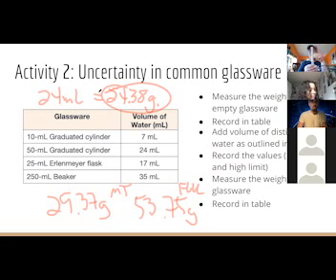So basically, when we're trying to measure 7 in our 10 mil, there's measurements above and there's measurements below. So that helps us determine whether we're over 7 or under 7. And the same thing is true with our 50. When we're measuring 24, we have measurements below 24, we have measurements above 24.